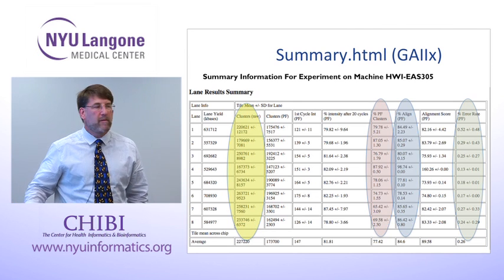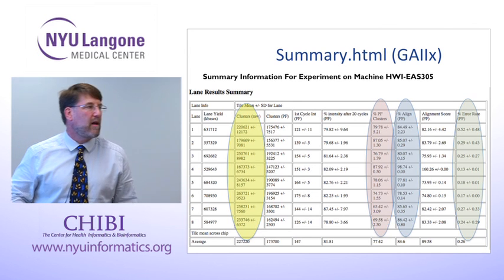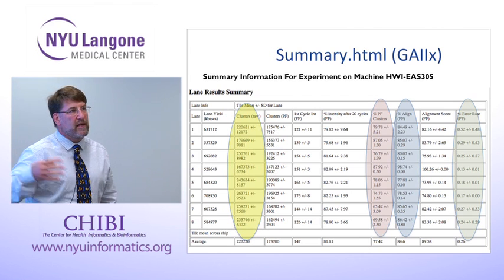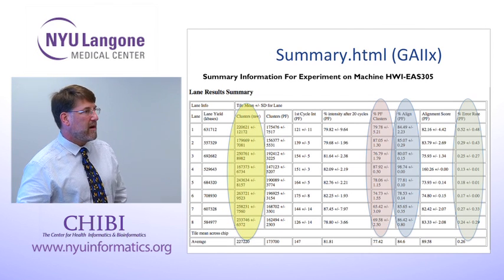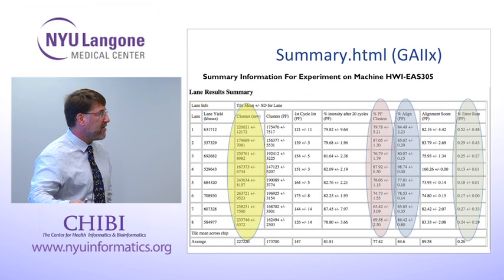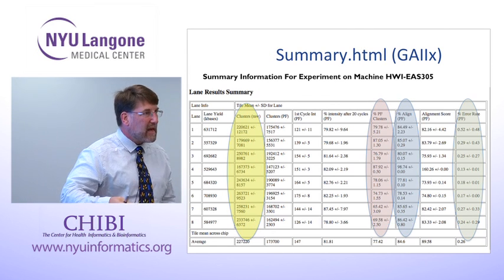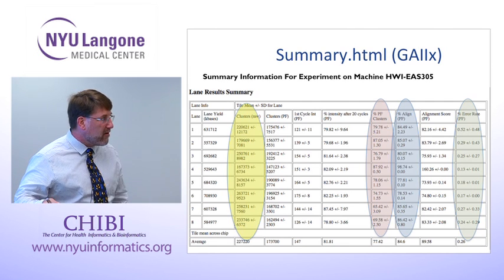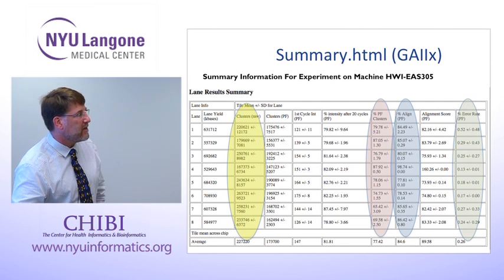You never get 100% for several reasons. First of all, there's some amount of contamination, which represents, in this case, ribosomal RNA. Now, we do a poly-A selection, so we get rid of a lot of that, but some creeps in. Mitochondrial RNA also creeps in. DNA from other organisms might be contaminating your sample.